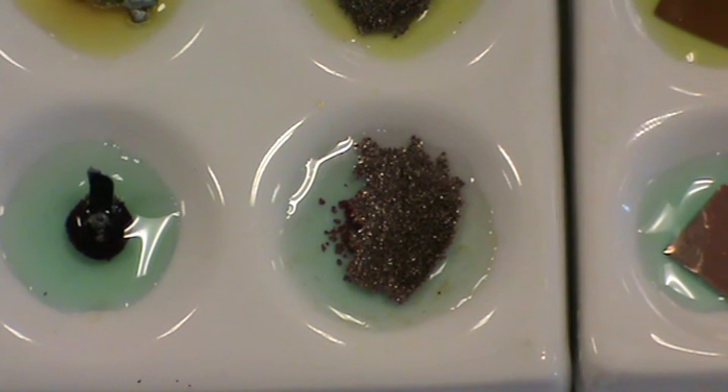A red-brown solid can be observed forming on the surface of the iron powder, indicating the formation of copper metal.